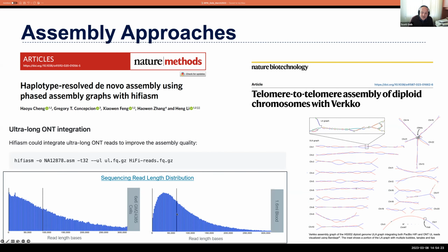It may be too that you don't need 100 kb reads every time, because maybe this is really about achieving reads that go beyond the repeat structure of the genome. If you're doing insects, maybe that's smaller than what you would see in vertebrates. This has really only been tested in a lot of human samples and in some vertebrate samples and things like that.